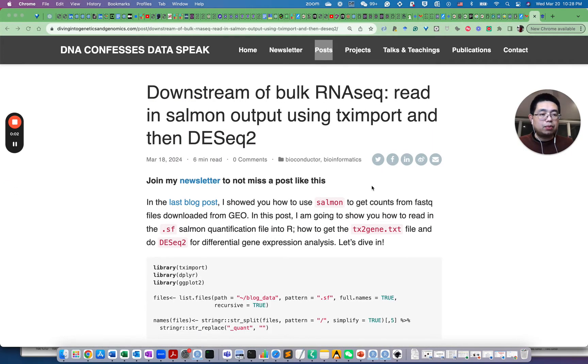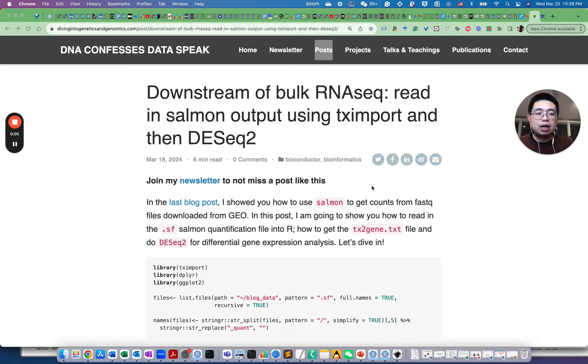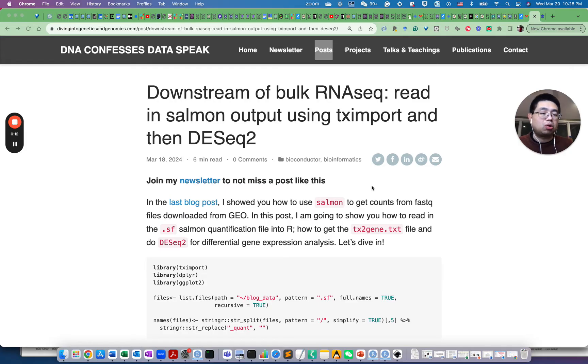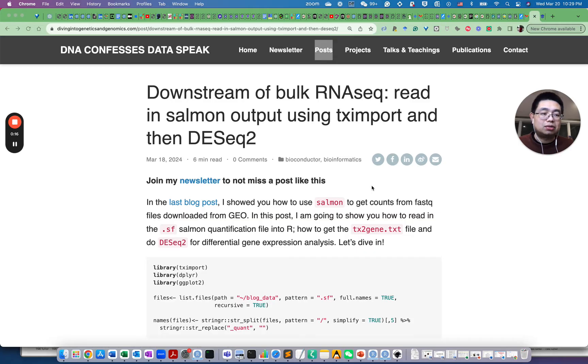Hello, this is Tommy. Welcome back to ChatOmics. In today's video, I'm going to show you how to use TX import to read in the Salmon output from bulk RNA sequencing data and then use DESeq2 tool for downstream differential gene expression analysis.